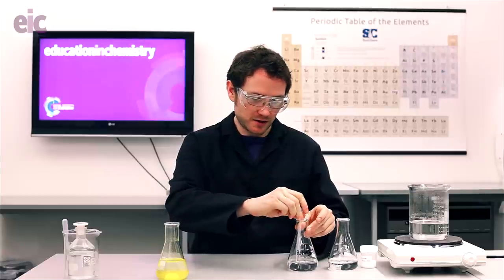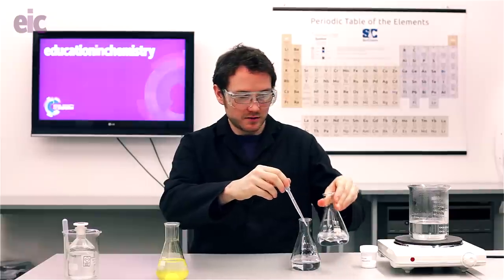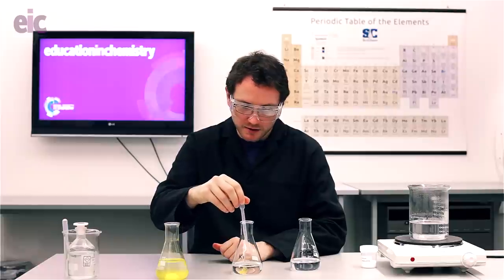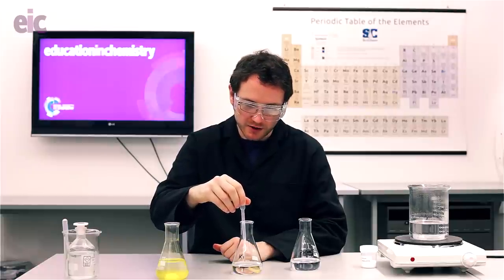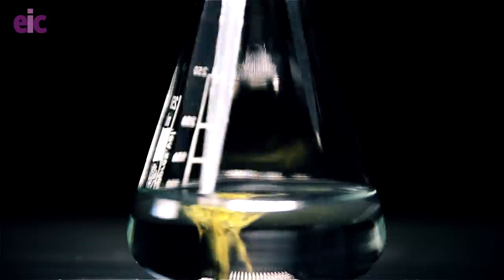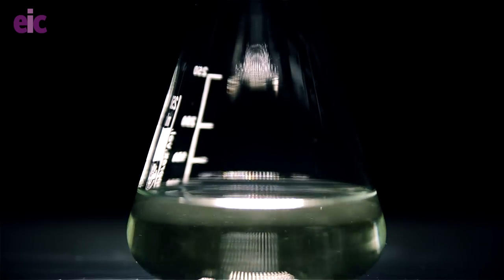There are a number of things you can do with this demonstration. First off, I like to start by adding the lead nitrate dropwise to the potassium iodide solution to produce some beautiful cloudy, almost ink-droplet effects. You'll find that as the lead iodide produced diffuses into the solution it might drop beneath the solubility product again and therefore redissolve, so you can do this a couple of times.